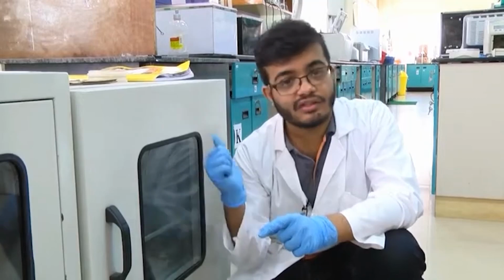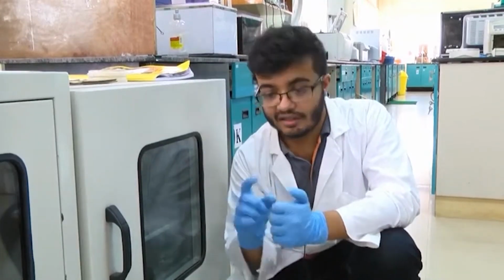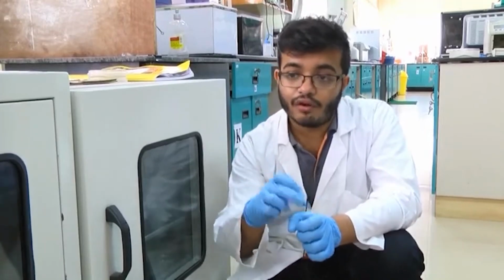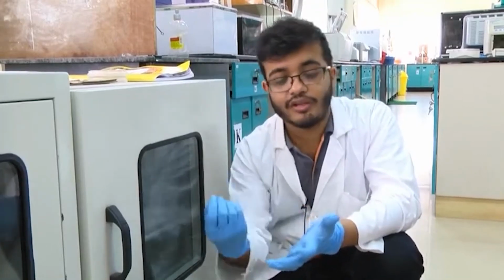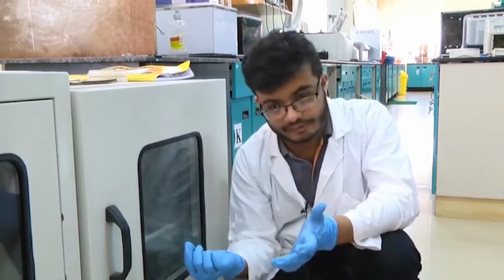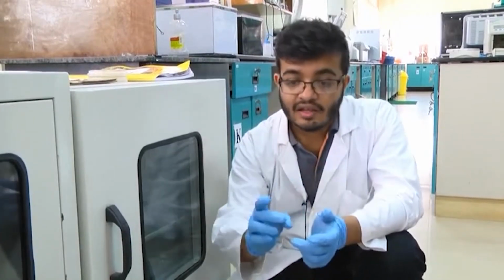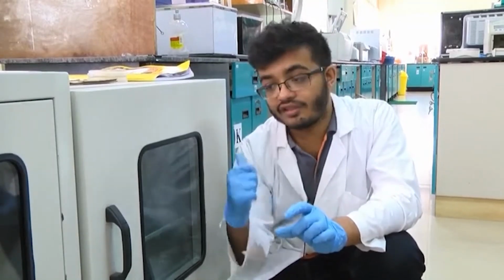So, take 500 microliters of that cell culture, add 500 microliters of glycerol to it in an Eppendorf tube, mix it thoroughly and store it in minus 80 degree centigrade. This cell culture you can subsequently use for regrowing further bacterial cultures, because from the plate you have already picked the colony, you no longer have it on the plate. Since you have grown 5 ml or 6 ml of it overnight, you take 500 microliter in a centrifuge tube, add 500 microliter of glycerol and store it in minus 80 degrees after proper mixing, and this will now act as a source for this particular culture.